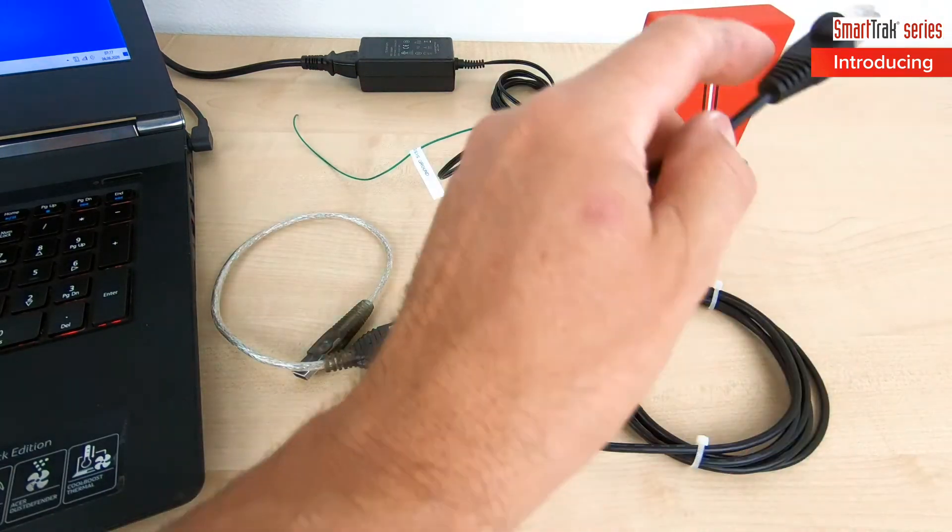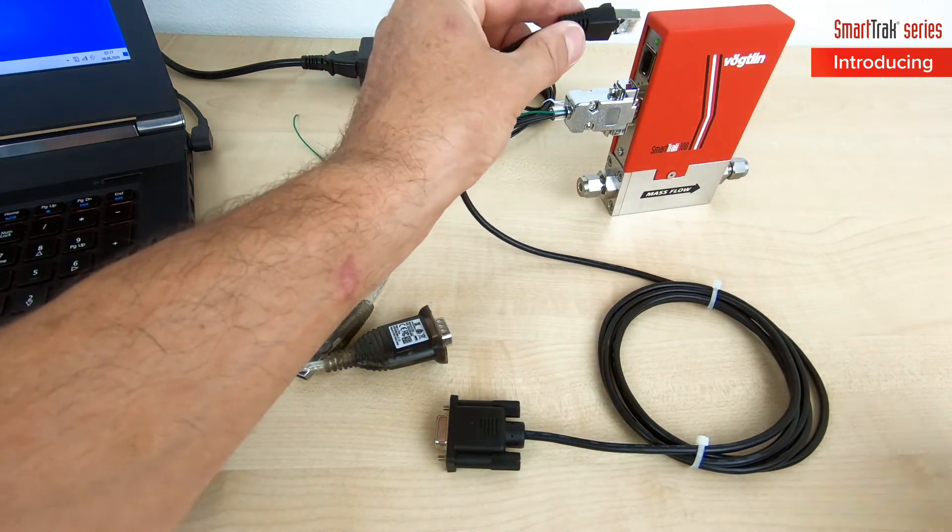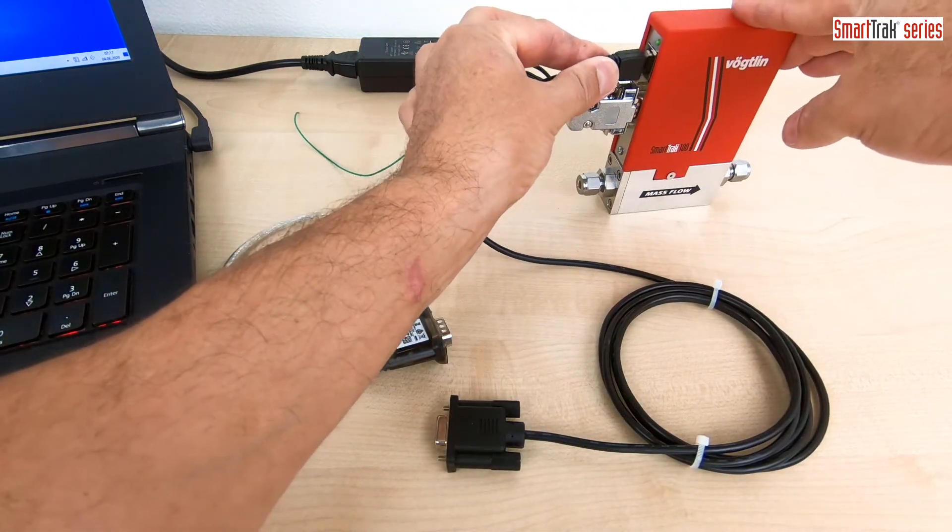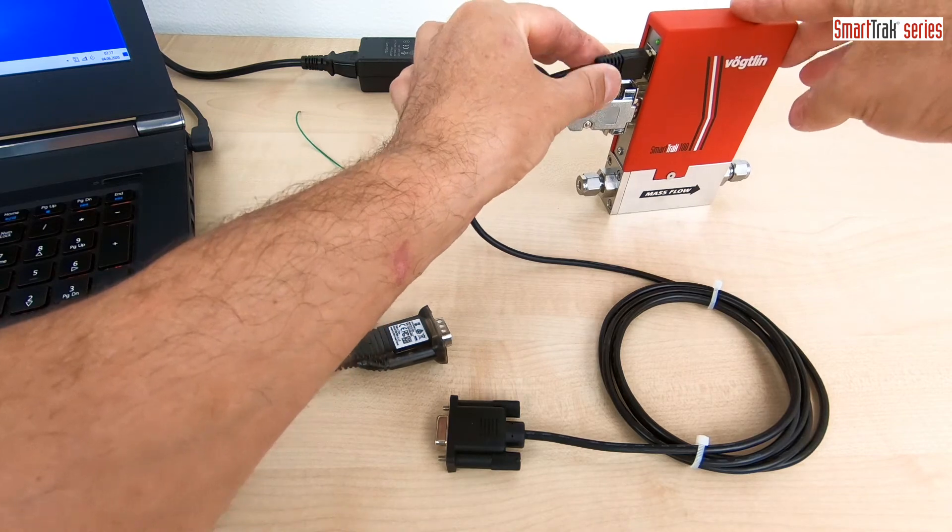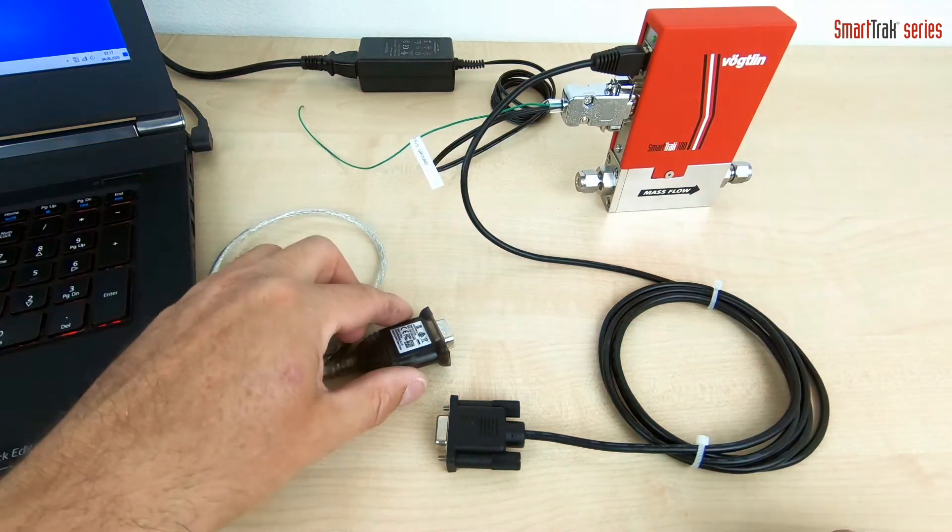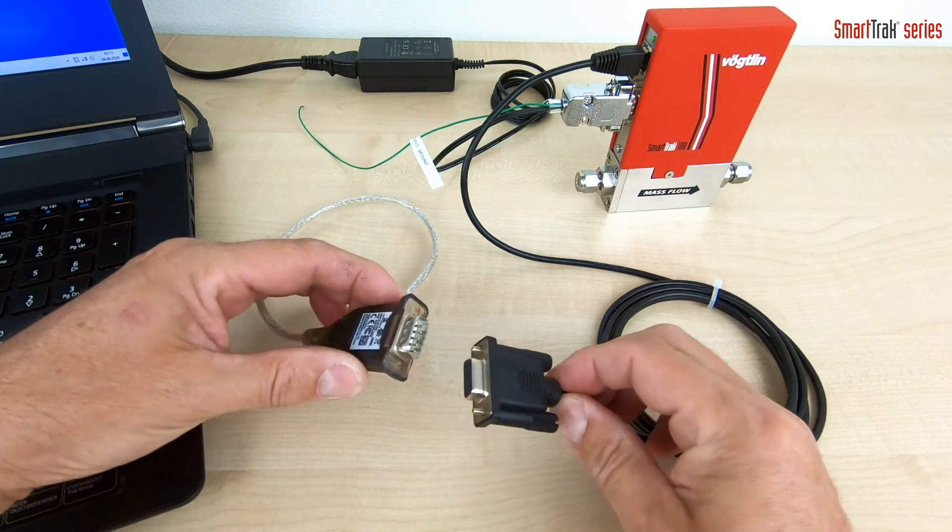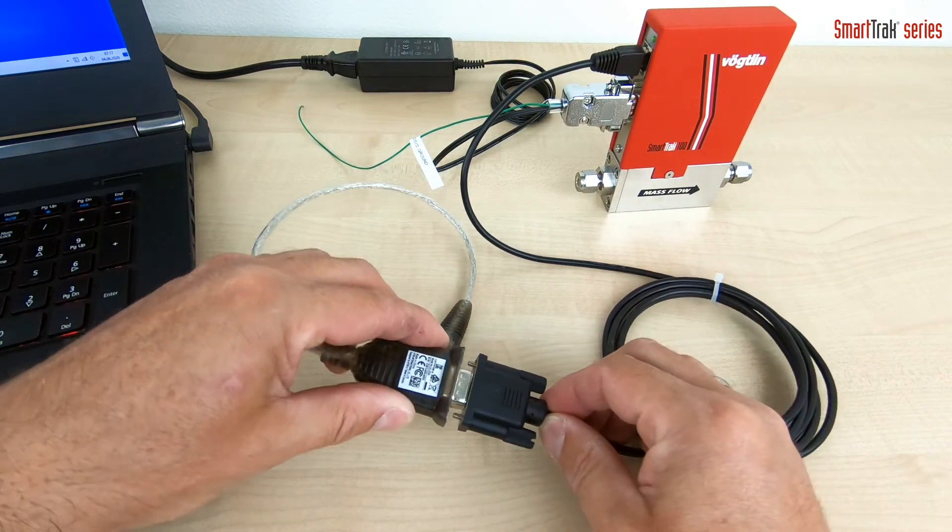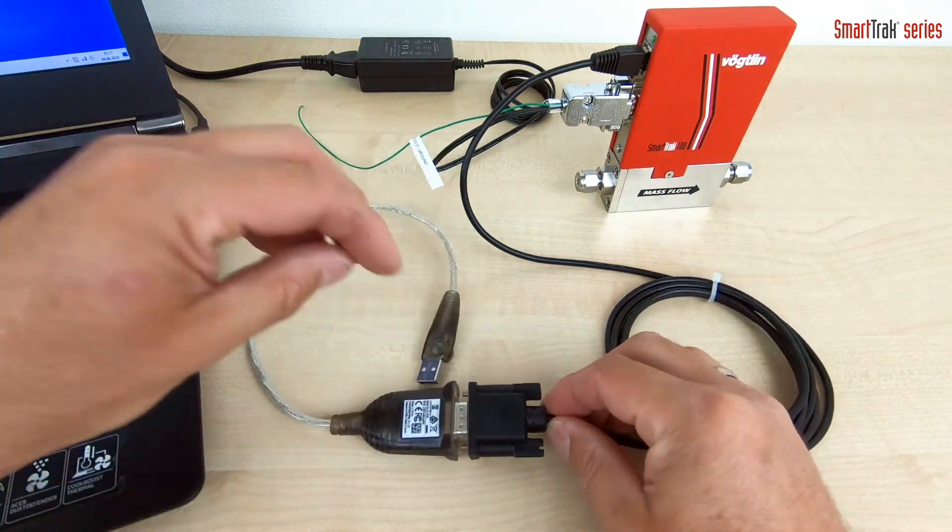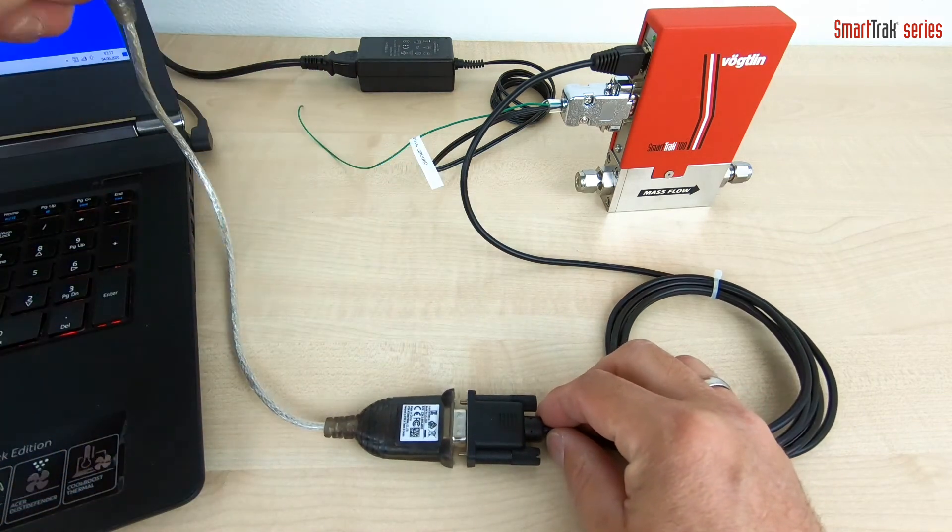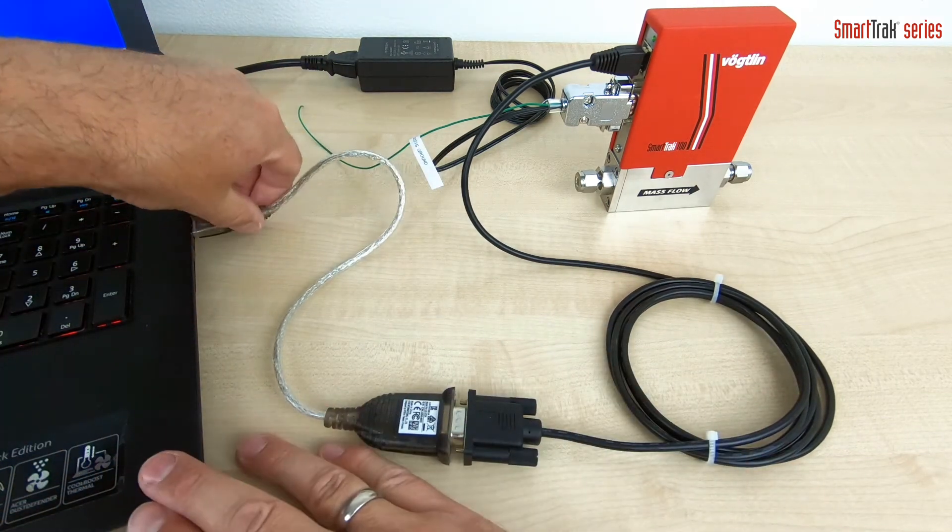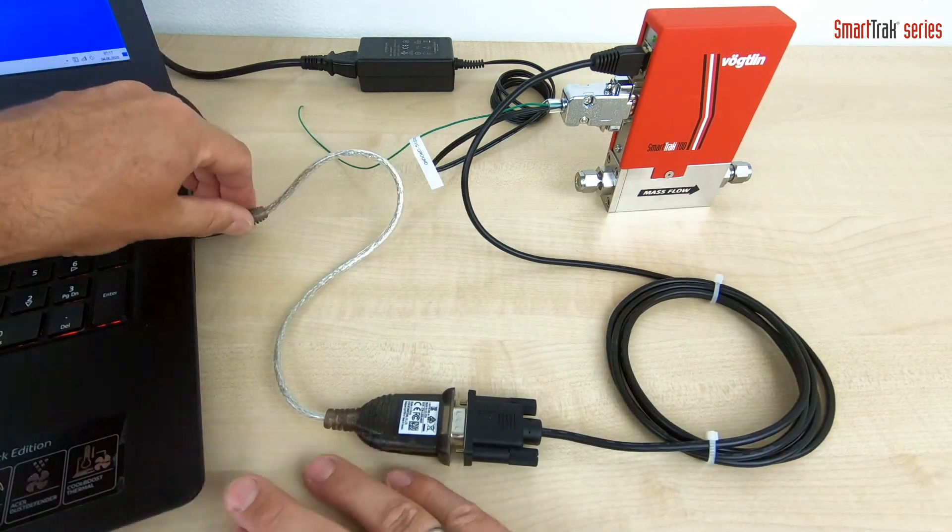Connect the RJ45 end of the RS232 cable into your SmartTrak. Plug in the SubD connector to the RS232 to USB converter cable and connect the USB end to your computer or laptop.